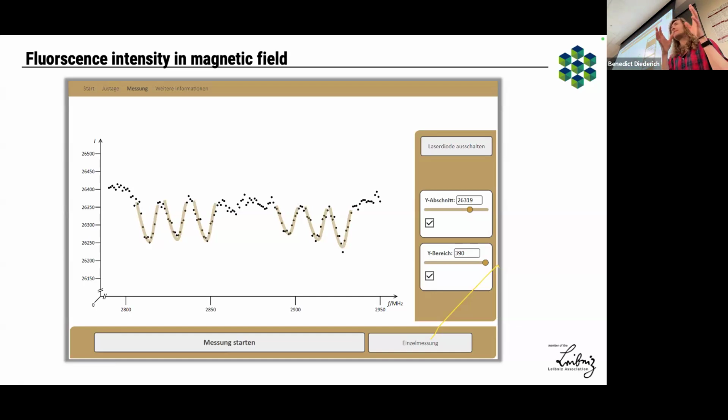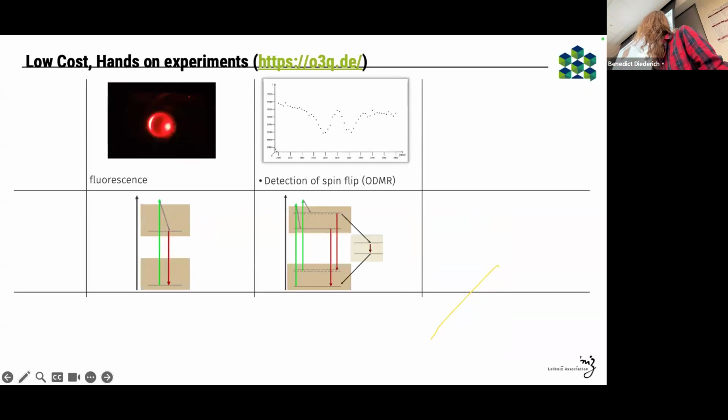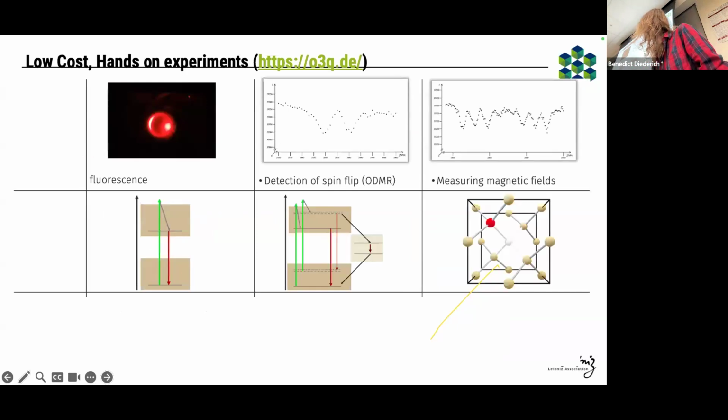And so they basically branched out, and then they were seeking a chance to bring that to the schools. And now we can do that together in an open space, which I personally like a lot. So yeah, the first, because I just skipped. So this is, I mean, fluorescence, you probably know from cells, but this fluorescence is also visible in solid bodies, like the diamonds. And then when you apply these different mechanisms, like for example, magnetic.